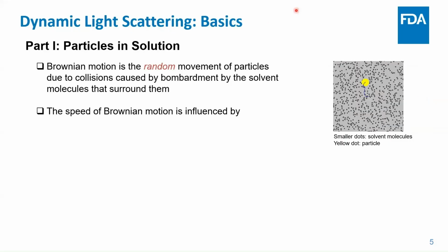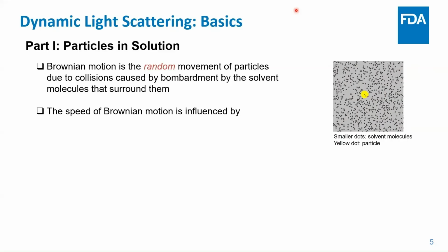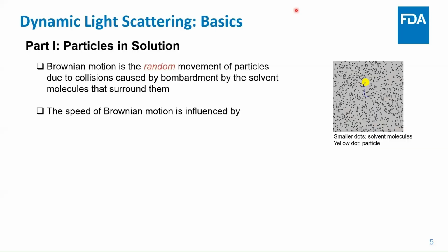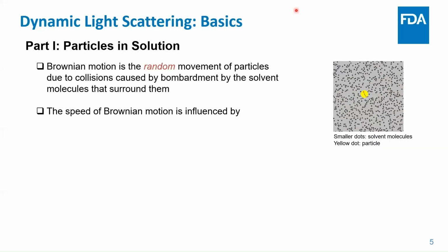I'm not seeing too much so far. Here we go. Size, shape, density. Size, sure. Temperature, I like that one. Yep, size of the particle.